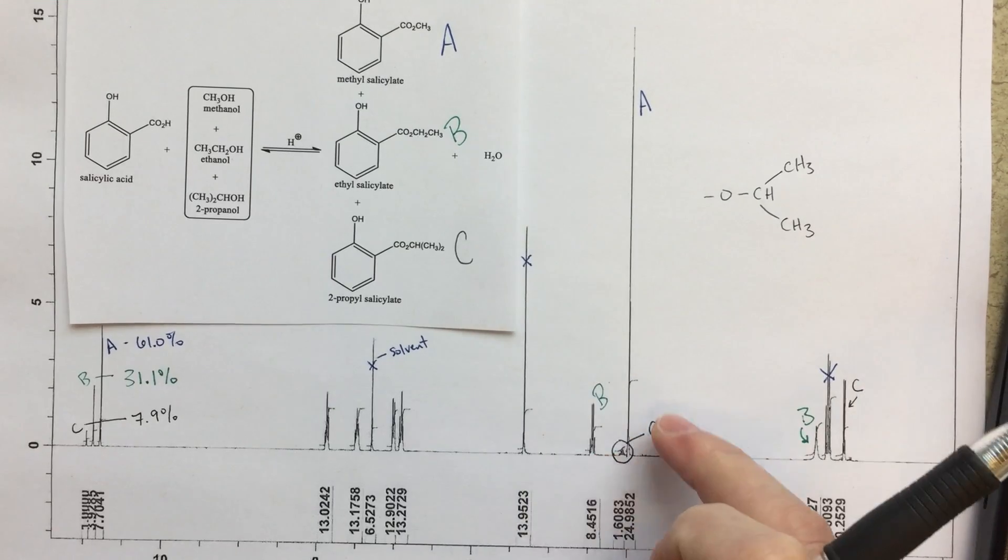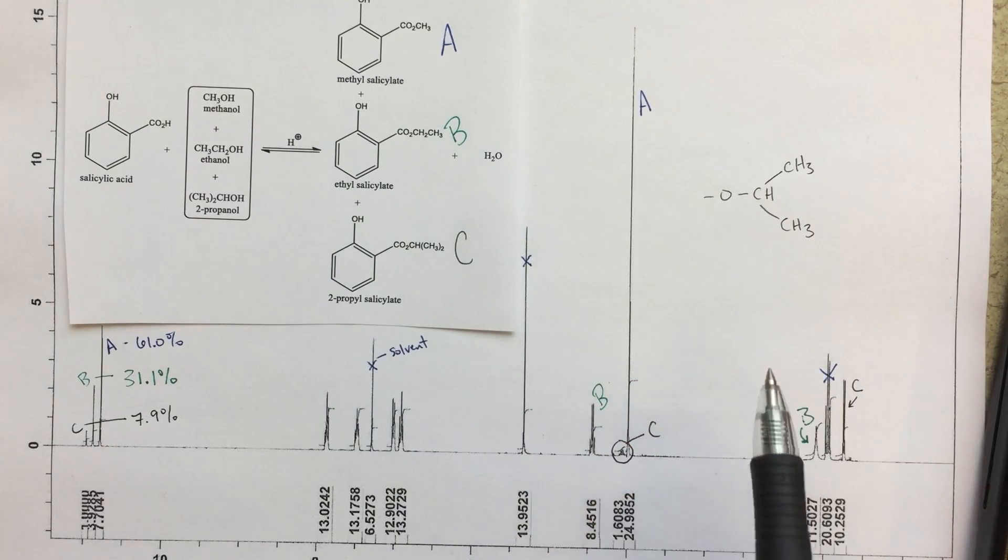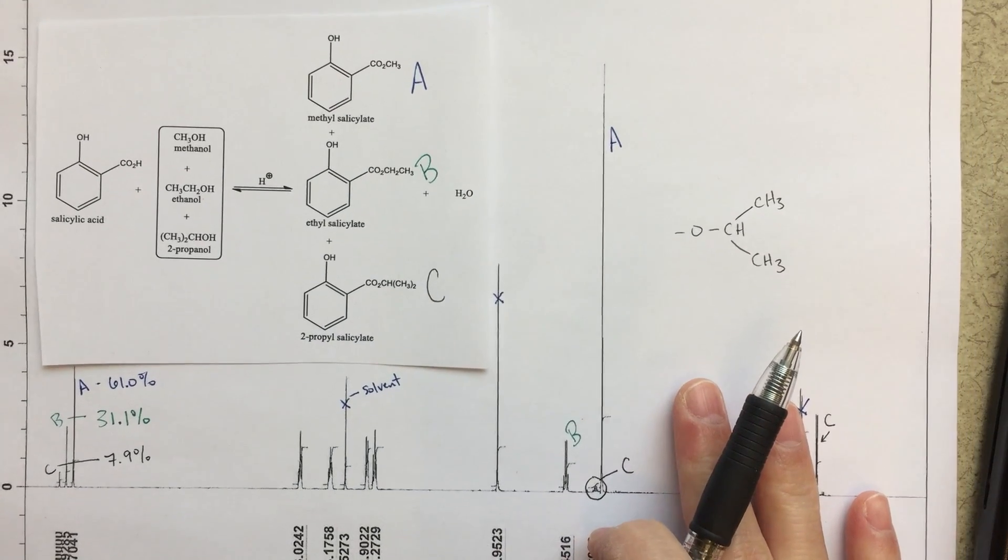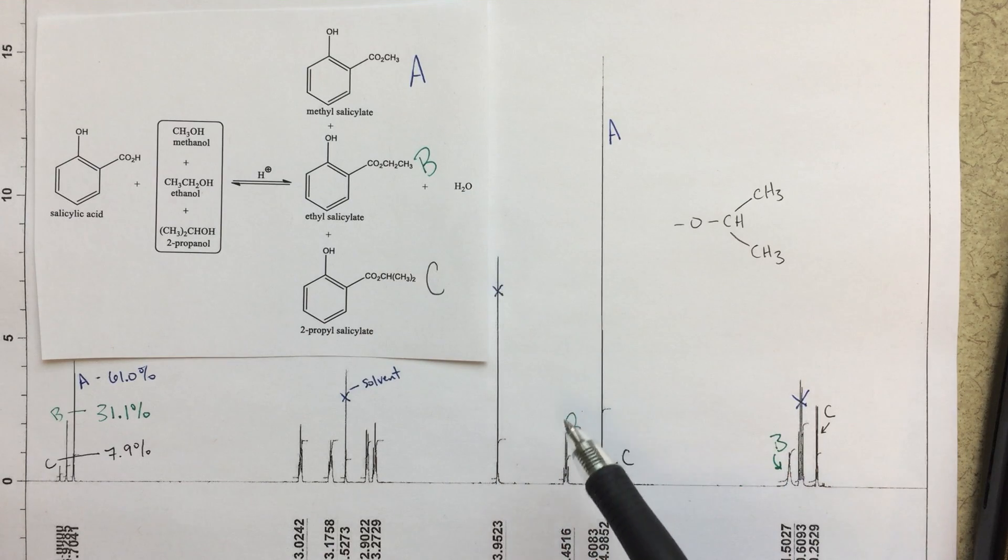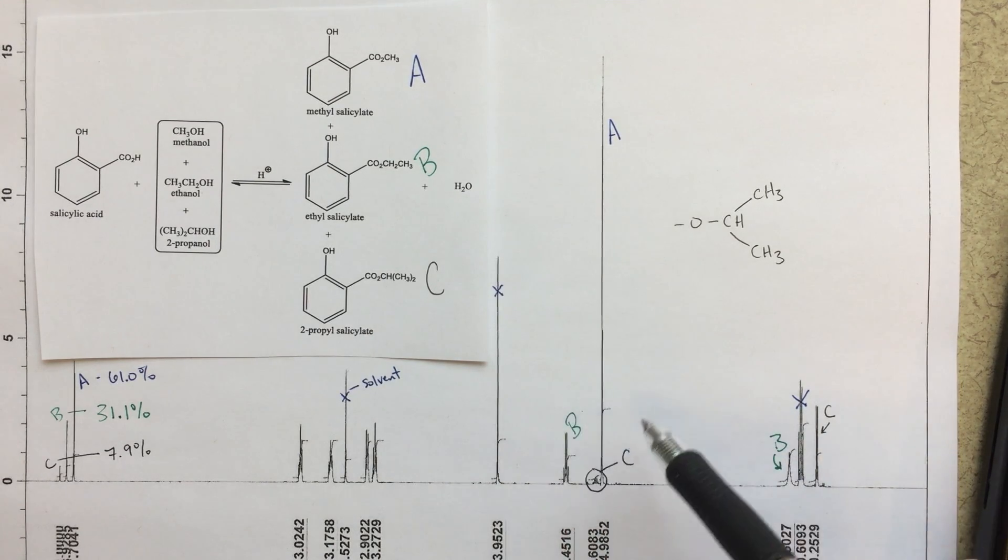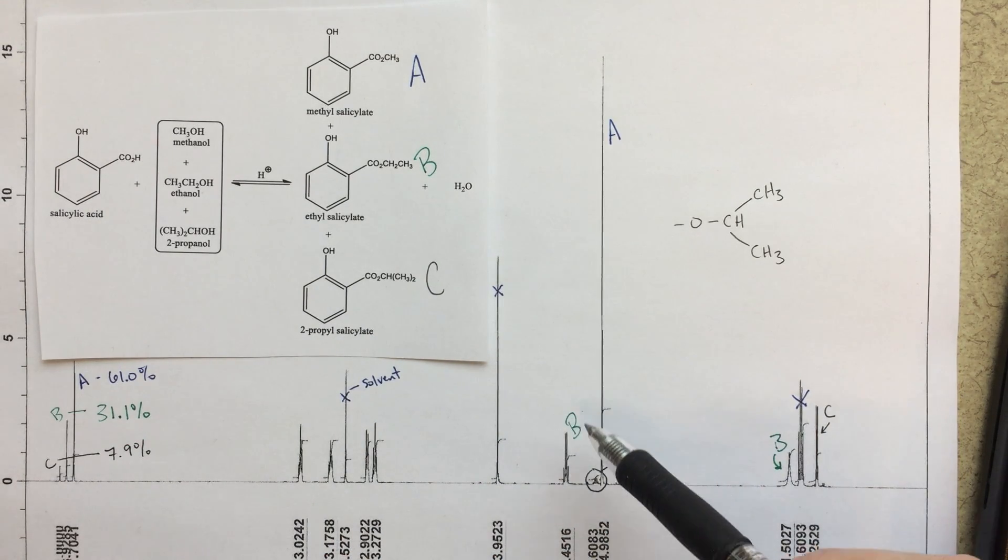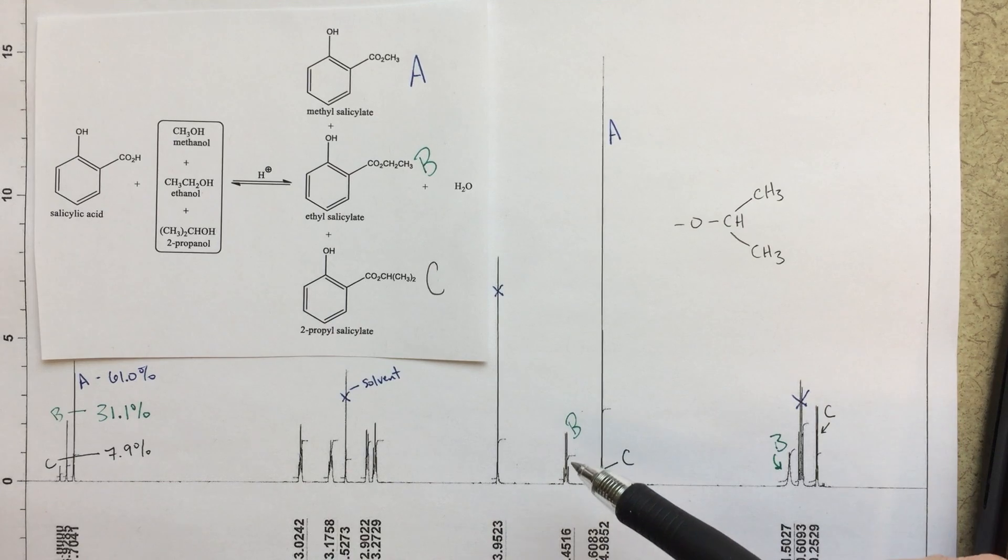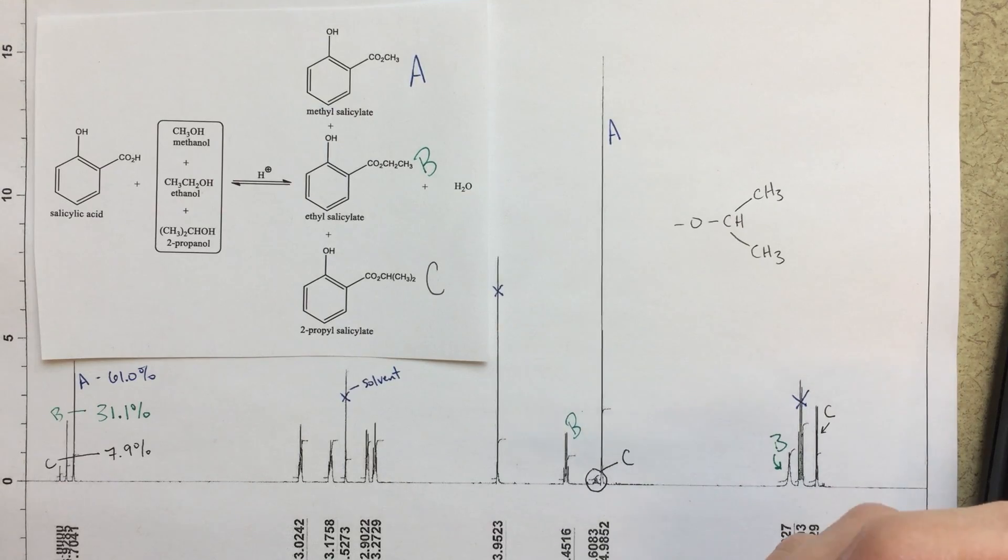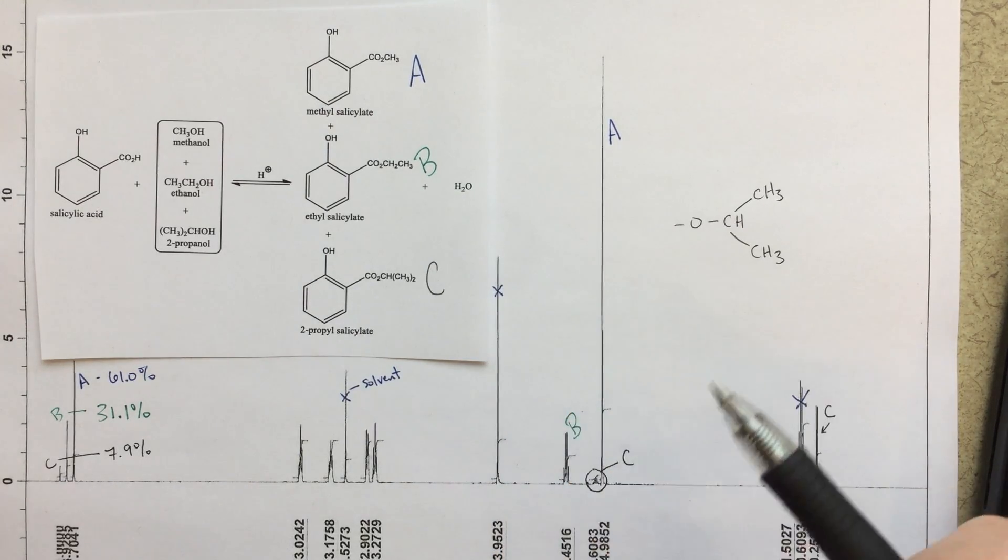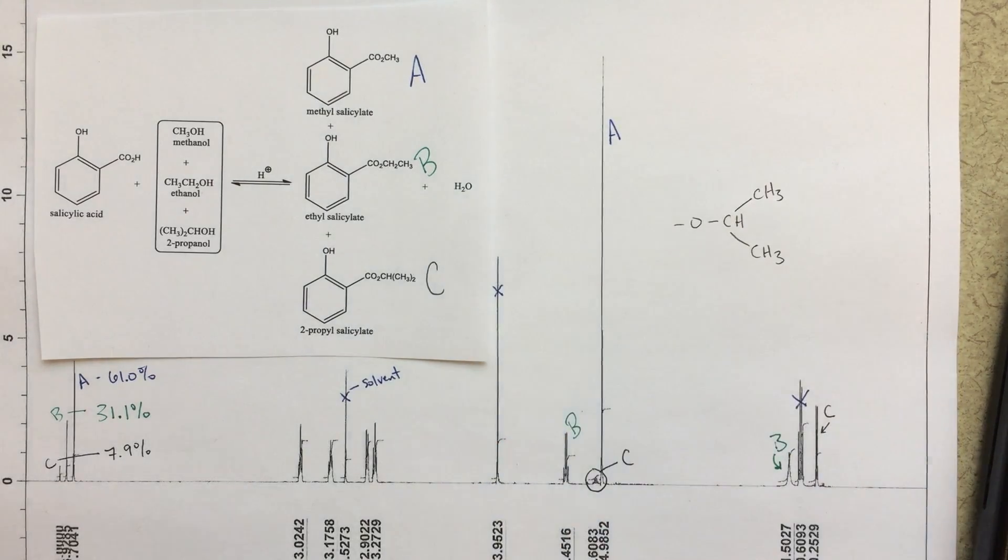Now, we could also do a similar thing for the peaks that we see in this region. So we've got more peaks that we can do similar type calculations for. So for A and B and C, we've all got peaks here. Now, what's different about doing this sort of treatment in this region is that the B peak here, that should integrate to 2 relative to A peak should integrate to 3, and the C peak should only integrate to 1.